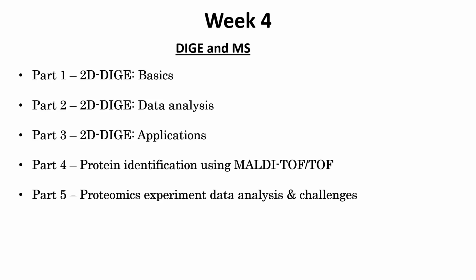In the first lecture of week 4, Sir majorly talked about the basics of DIGE, and then he talked about how we can do data analysis using the DIGE experiment itself, and applications of DIGE. Those were the initial 3 lectures belonging to the DIGE technique itself. The later 2 lectures were based on the mass spec technique, on how mass spec can be used to help with proteomic analysis.